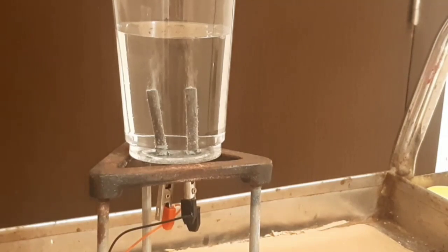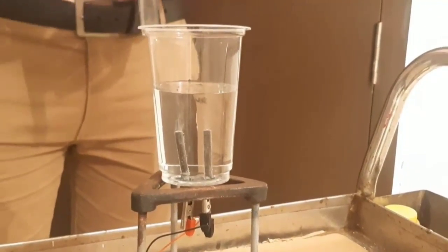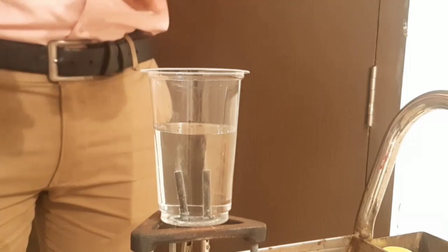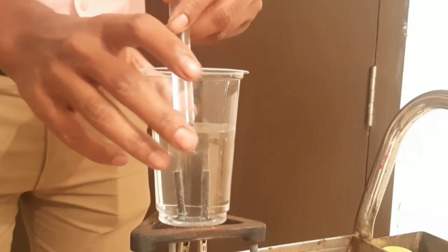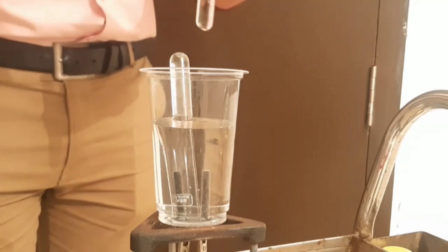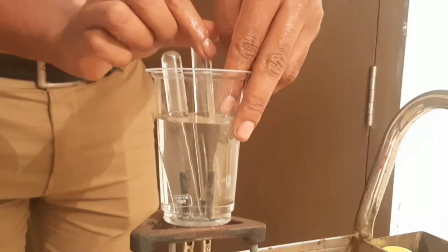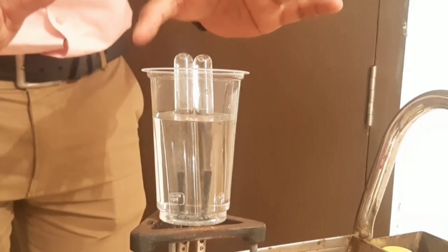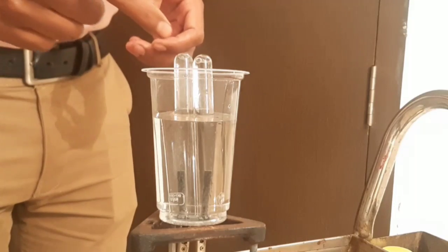Now let's go to the next part. I have taken two test tubes filled completely with water. In order to collect the gas, I'll keep them inverted on each electrode — the first test tube inverted on the first electrode, and similarly the other test tube inverted on the other electrode. We are collecting those bubbles — the gas getting out — which will collect inside the test tubes.